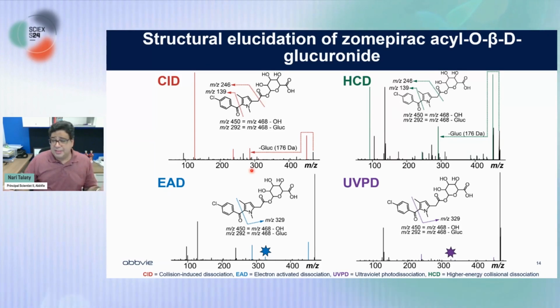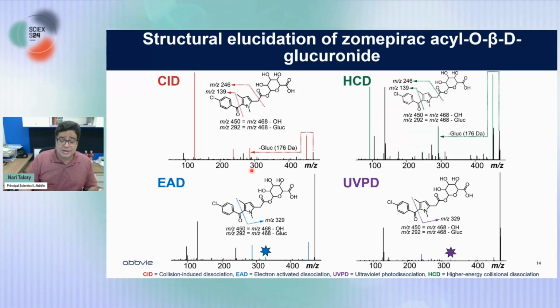Now, the fact that we're working with high resolution instruments, with low ppm accuracy on each of our fragments, means we can comfortably identify them. This is something that all of us in our group had to get used to: we are looking at fragments that genuinely have lower intensity than we are used to seeing with, let's say, HCD or CID.